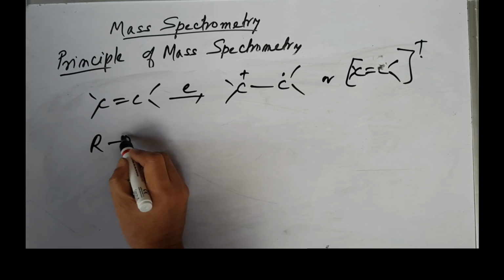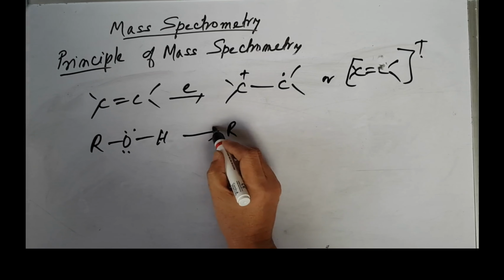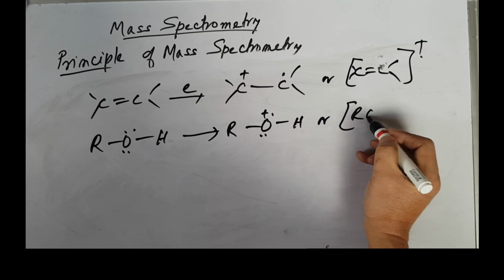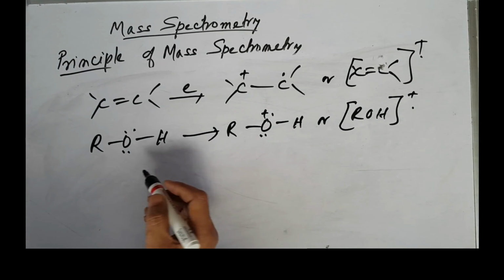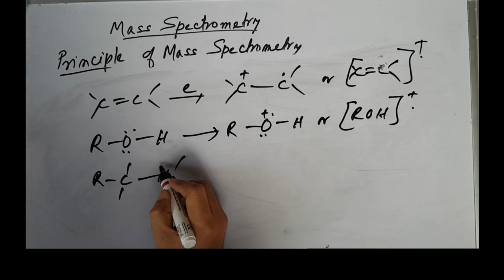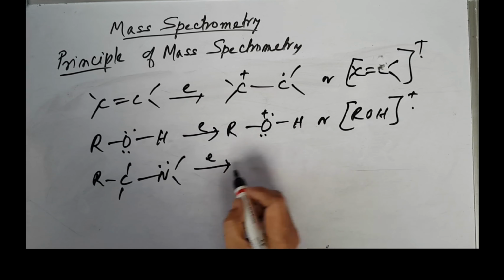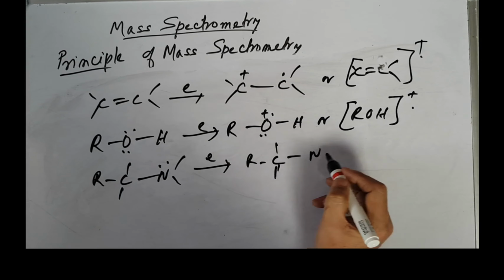Sorry, alcohol also you can have. Here, whatever one electron is knocked out, you can have a positive charge, and O is like this. So these are molecular ions. You can simply write ROH plus. So this is the molecular ion or parent ion. Similarly, amines also you can have. Let's say this hydrogen or N. Amines are like this, so you can knock out an electron. Bombarded with high energy electrons, you can have this parent ion or molecular ion.